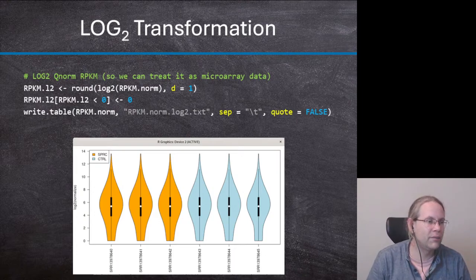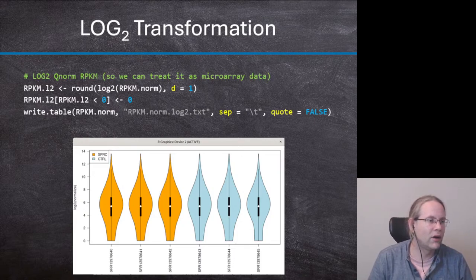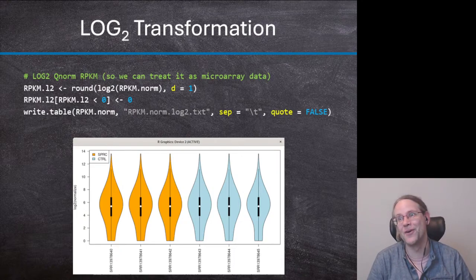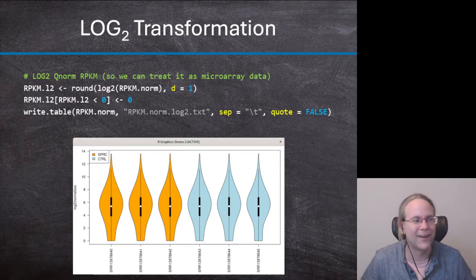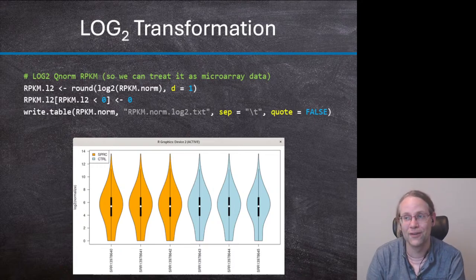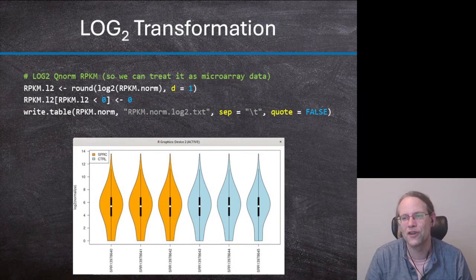Doesn't R have any package to calculate the RPKM step and normalization? Yeah, R has packages for that, but the thing is called writing your own pipeline from scratch. And that's why we're writing everything from scratch ourselves, right? So of course there's RPKM values. There's even packages which will do the whole thing for you, where you just give the FASTQ files and it will do the alignment and everything.